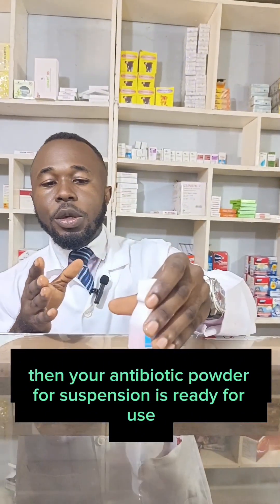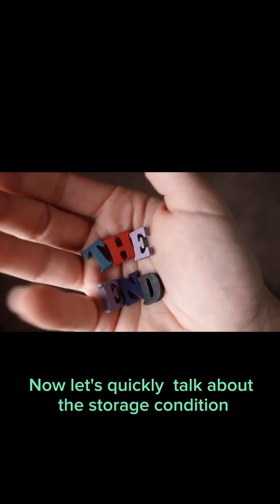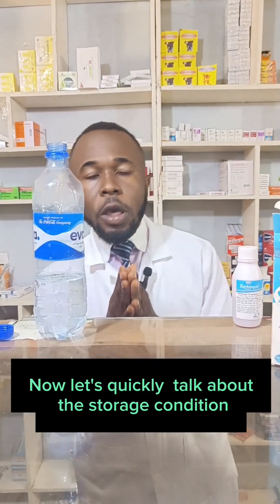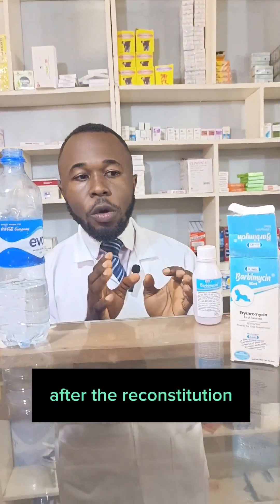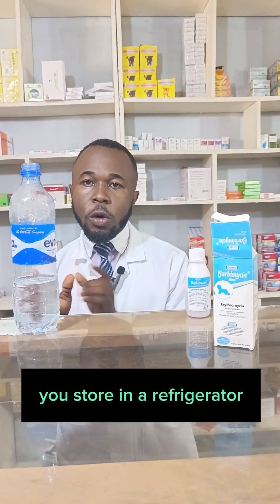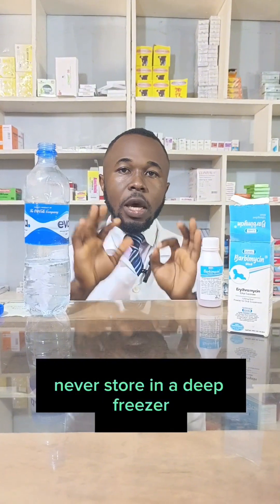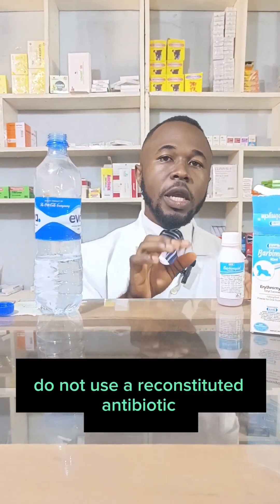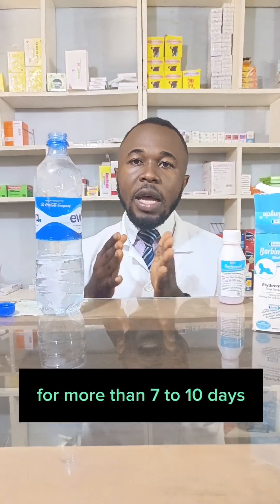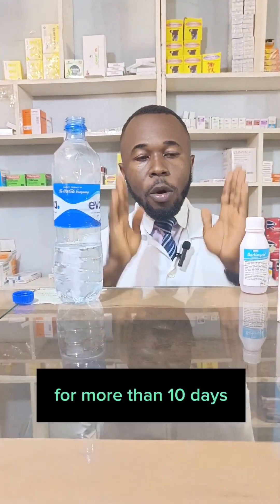Let's quickly talk about the storage condition after reconstitution. You store in a refrigerator, but never store in a deep freezer. Regarding the duration of use: do not use a reconstituted antibiotic for more than 7 to 10 days. Never use a reconstituted antibiotic for more than 10 days.